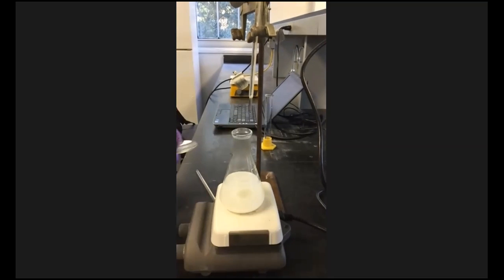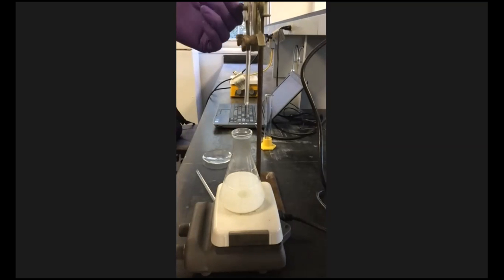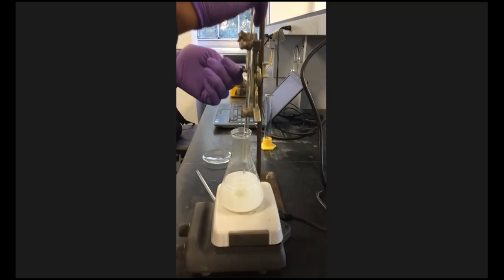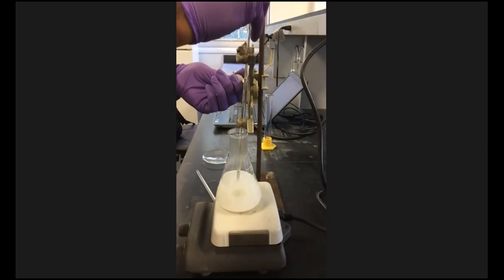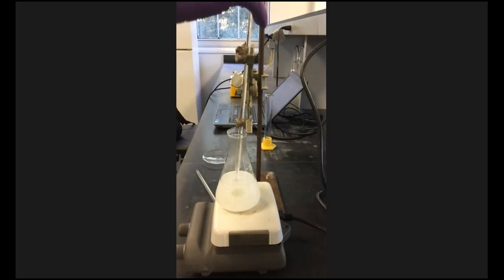Check the temperature again. A minute 30. Turn that off. I don't want it to overheat. These hot plates are notorious for they'll start out gentle and then you look up and the temperature gets to 100. Yeah, they do that a lot. So it's always good to keep tabs.